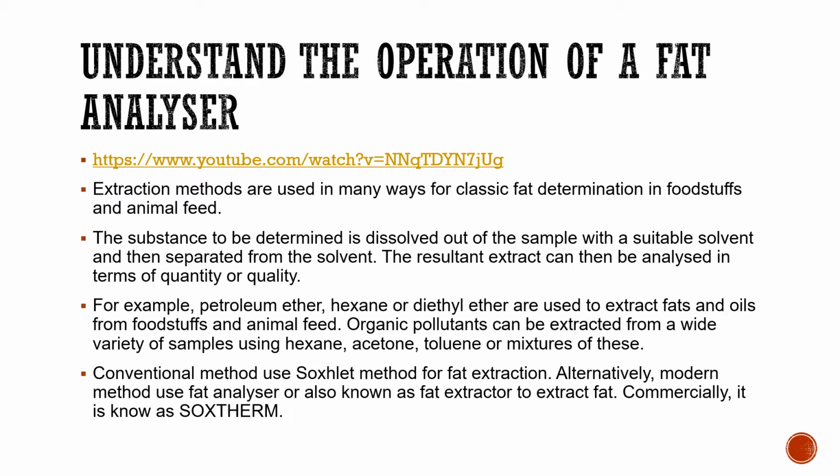Alright, so there is a video to understand the operation of the fat analyzer. You may watch the video later. You may click the link from the slide that I will give you after this.